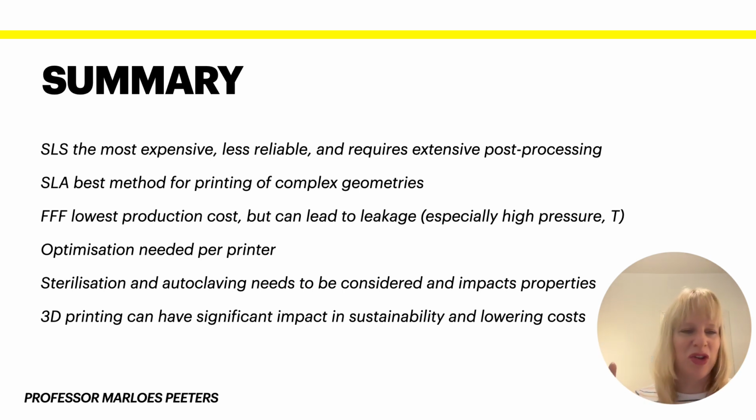However, here I've mentioned lots of perhaps downsides. If we think of the sustainability impact, this will definitely bring benefits. So you can use things such as, for instance, recycled materials. And generally, we know with 3D printing, there's less waste produced than with lots of other production methods. Another thing to consider is particularly the lowering of the costs, because you can use very low cost materials. And it gives you a lot of flexibility.